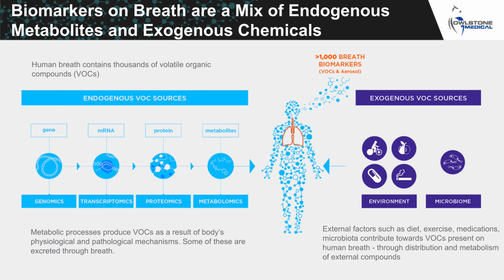The other source is exogenous metabolites, which come from diet, smoking, medication, and also from the microbiome of the gut or from the microbiome of the airways. All of these together mean that the VOC profile in our breath reflects our entire phenotype, providing detailed insight into how our body is functioning. So when the body's functioning changes, these VOCs on breath are well suited to detect such changes early.